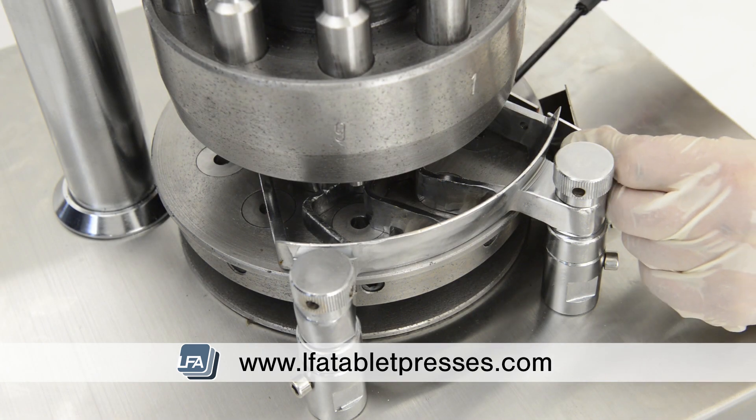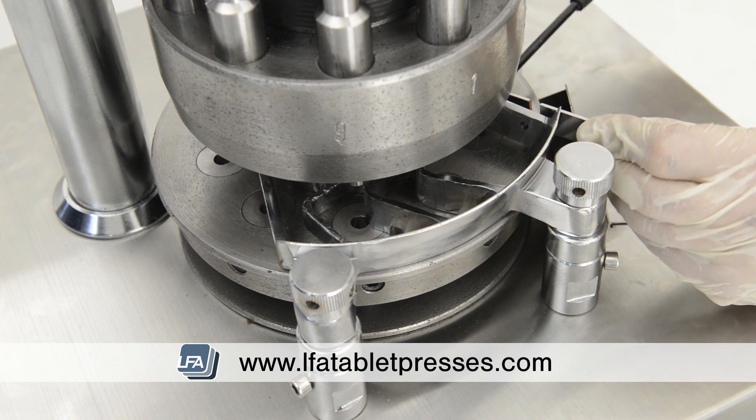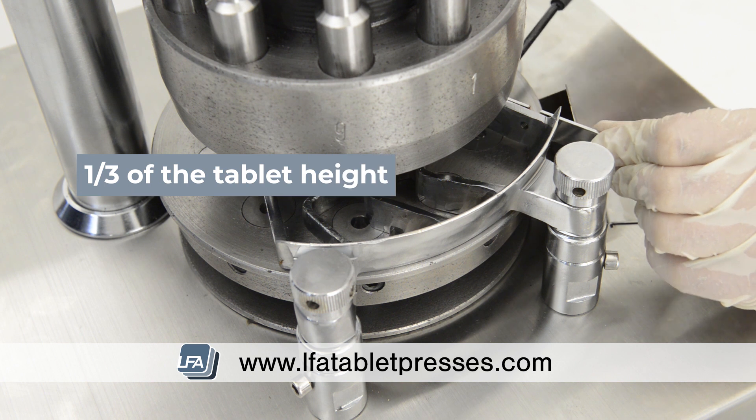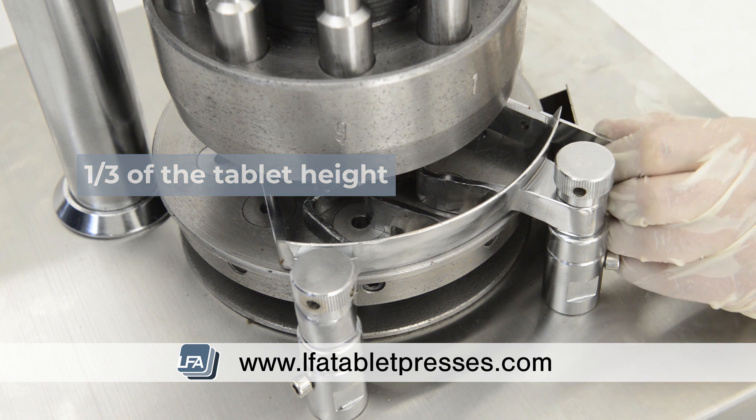Now we need to replace the tablet takeoff blade. Using the two screws, we need to ensure the formulation can pass under it, but a tablet can't. A general rule would be to mount it at one third of your tablet height. If your tablet is three millimeters thick, you should mount your tablet takeoff blade at one millimeter.